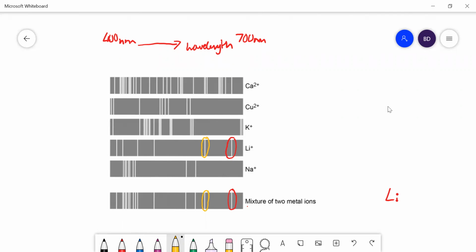What we haven't accounted for are all those bands there, down in the bluey part of the spectrum. And where is a good candidate for them coming from? It could be sodium. That's got a load of bands there. I would say that is probably right, because sodium also has this yellow band here, which is represented in that spectrum.